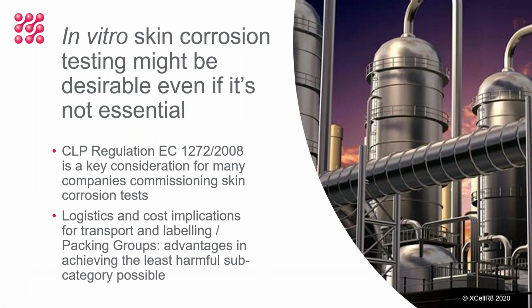I just wanted to point out that sometimes skin corrosion testing might not be essential if you are able to establish a weight of evidence to show whether something is a corrosive or a no category. But for us, in terms of our experience working with companies, for many, the CLP regulation is a key consideration for many companies that are commissioning these tests.